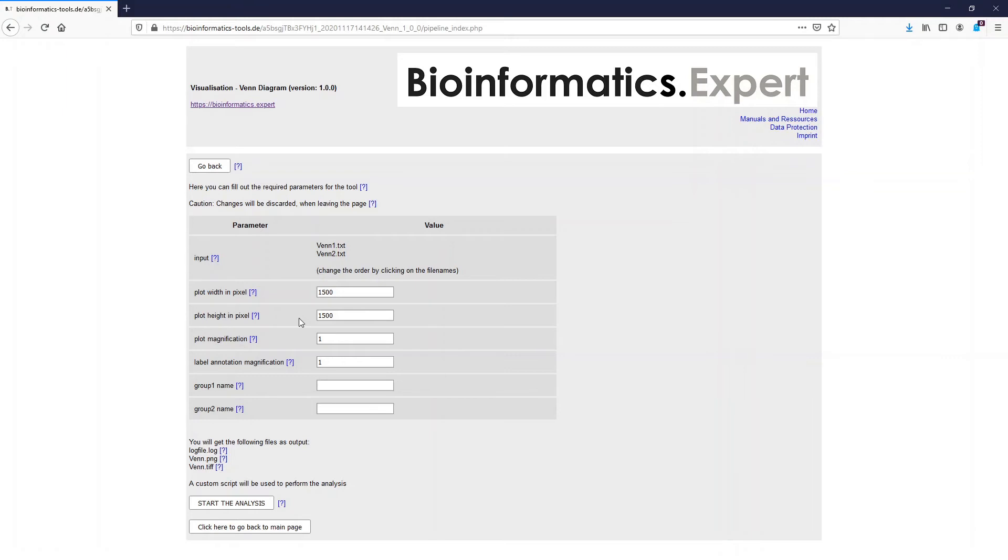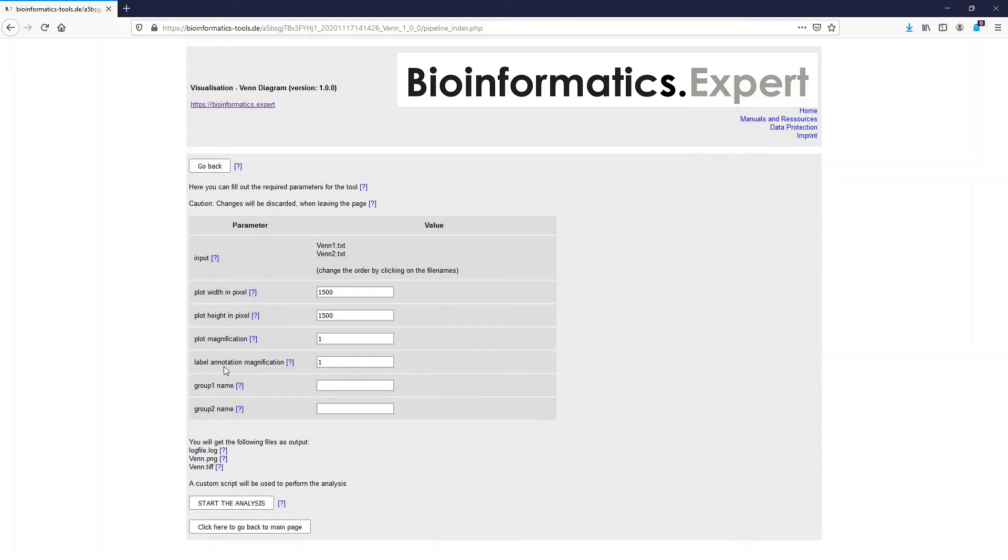As output you will get a 300 dpi tiff and png file so you can directly use them for publication. When you change the plot magnification and the label annotation magnification values you can change the font size of the label or the annotation of the plots.